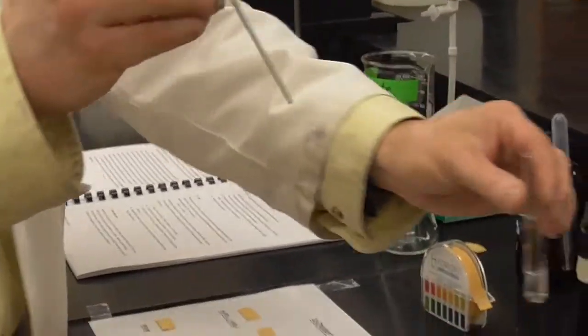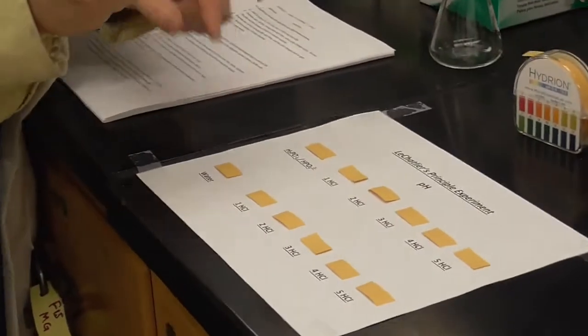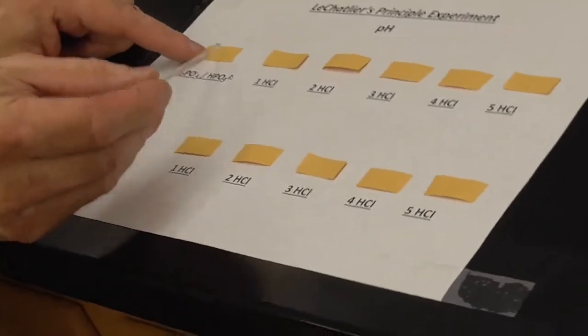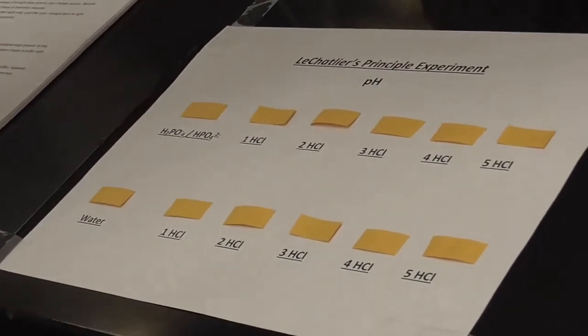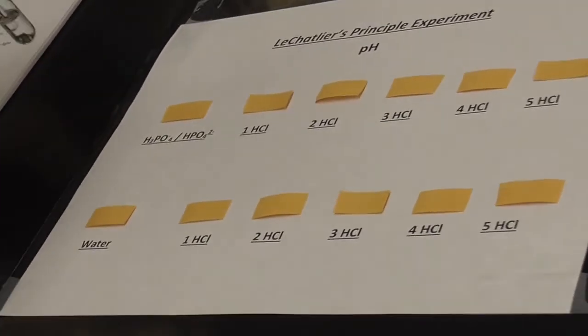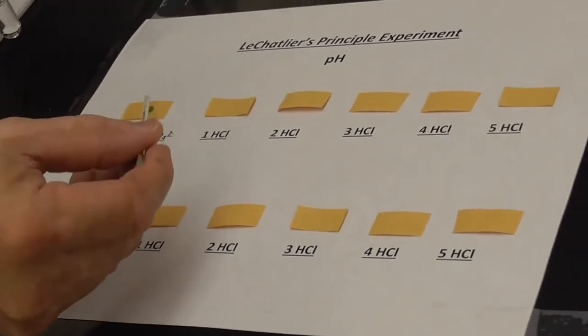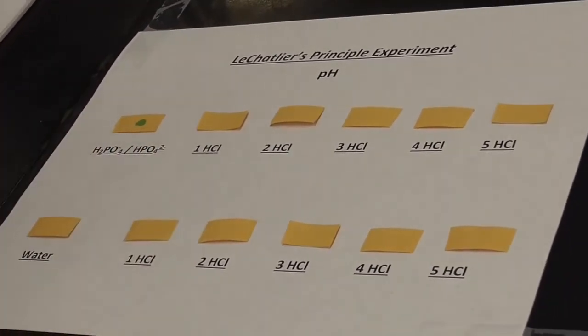Just to start off, let's see, and here we go. If you can zoom into that. Oops, I don't think I got just a little bit. Let's see if I can get a bigger drop hanging off of my. It's not, there we go. I was just using the wrong side.